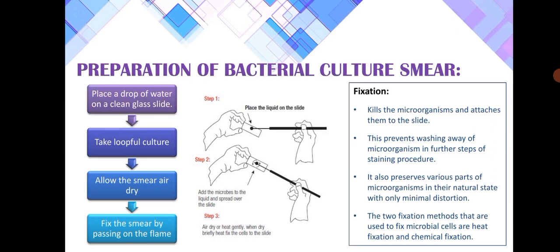This includes placing a drop of water on a clean glass slide, taking a loop full of culture, allowing the smear to air dry, and fixing the smear by passing it over the flame.